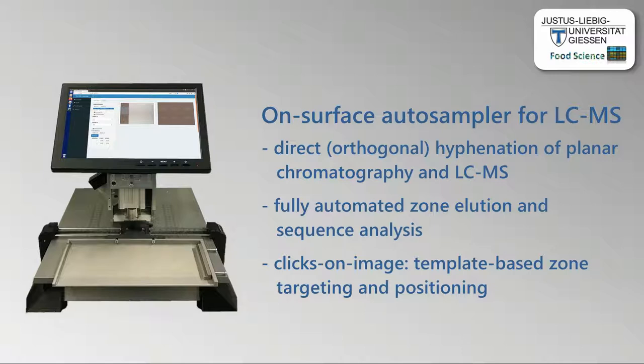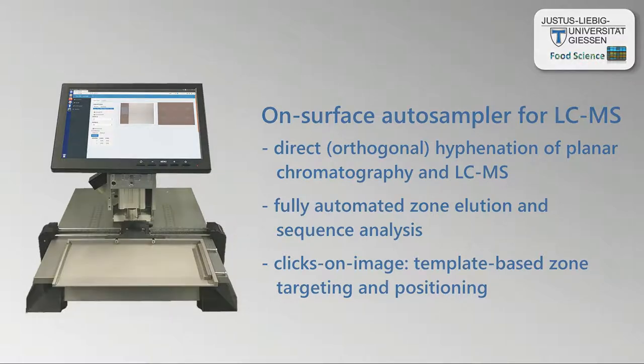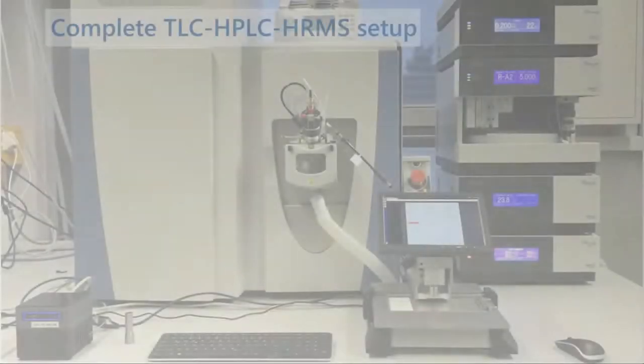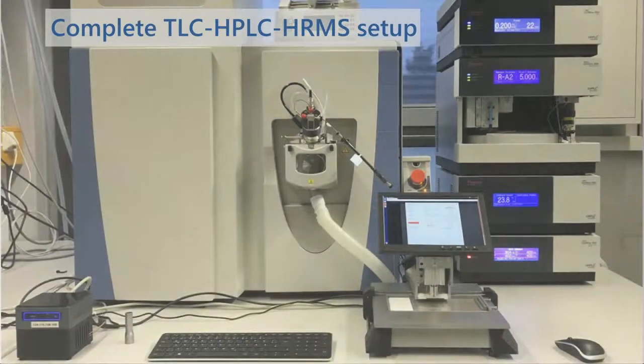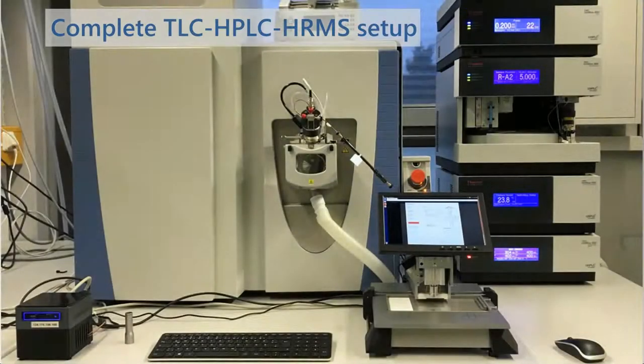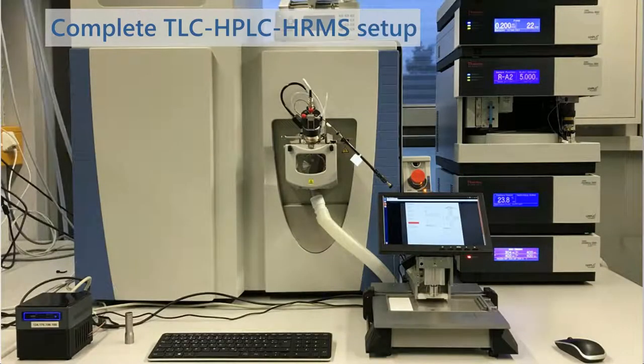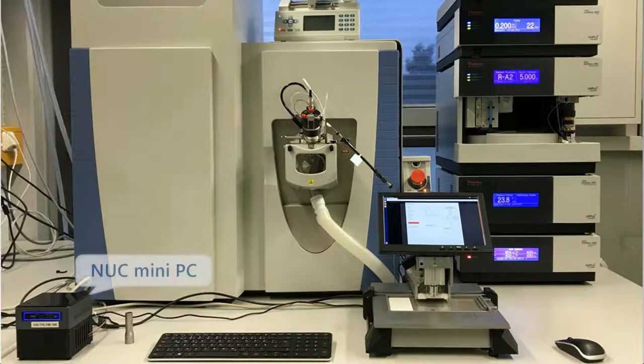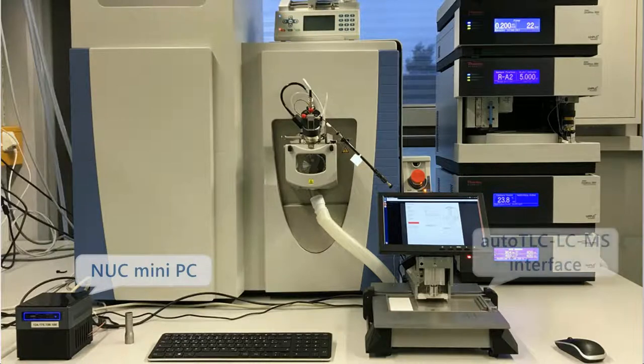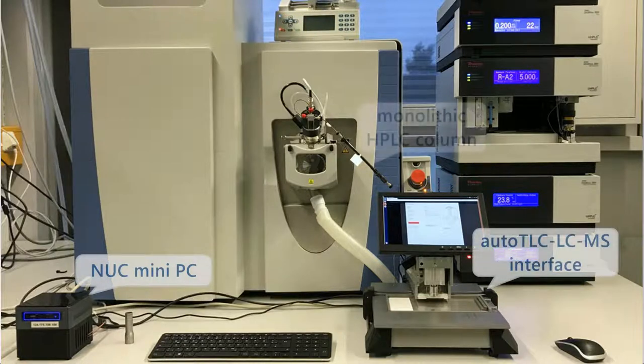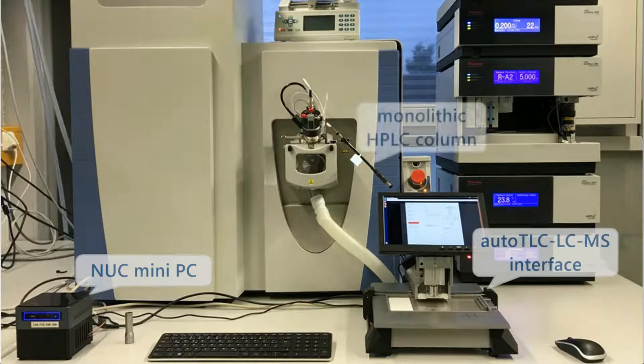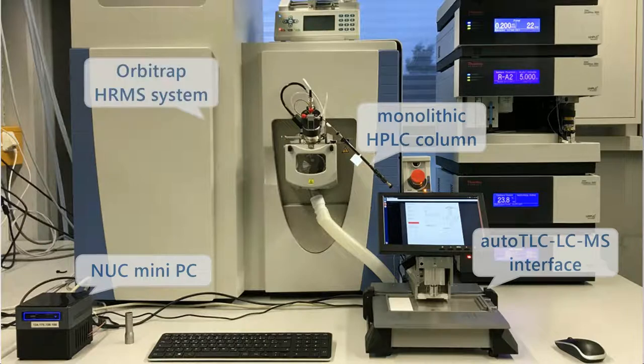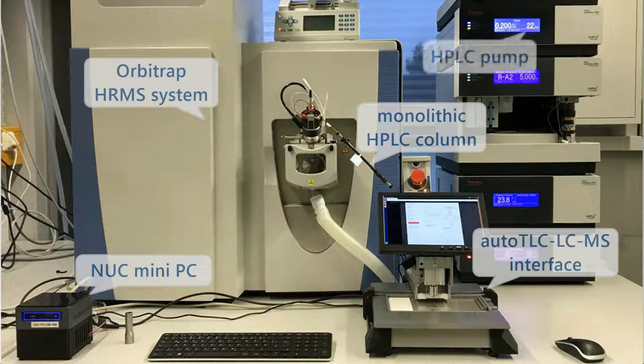Template-based zone targeting and positioning is possible via simple clicks on the image. Our complete TLC-HPLC-HRMS setup consists of a mini-PC controlling the Auto-TLC LC-MS interface, as well as a monolithic column directly installed between the interface and the mass spectrometer, in this case an Orbitrap HRMS system. An HPLC pump provides the eluent flow to the interface.